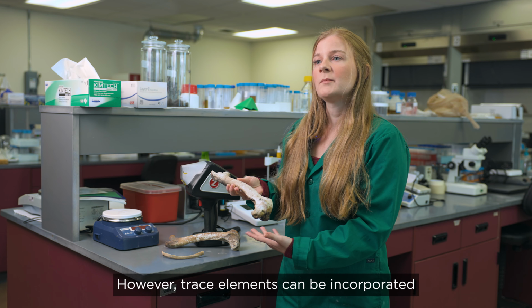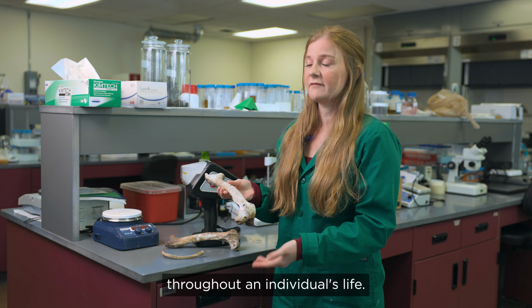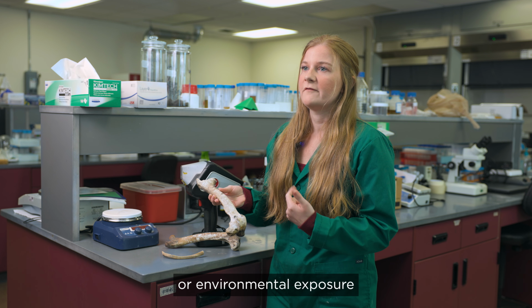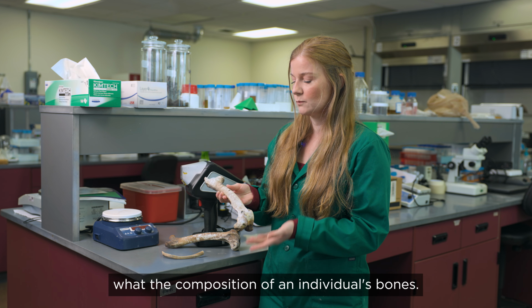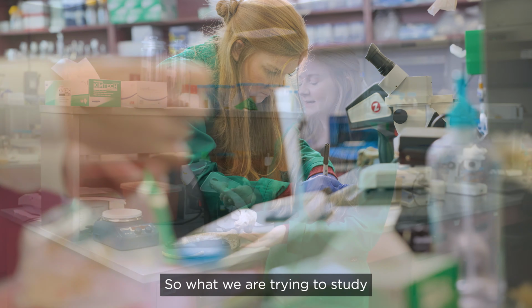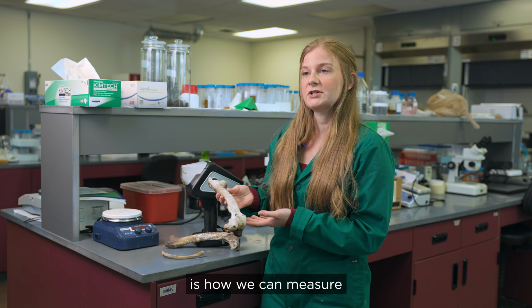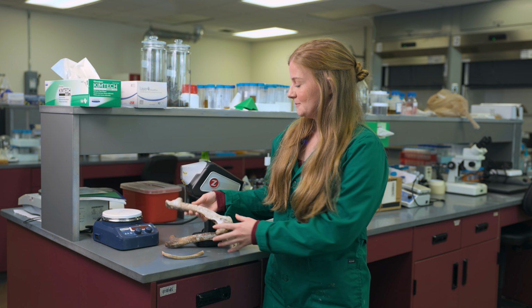However, trace elements can be incorporated into the bone matrix throughout an individual's life. Things like diet or environmental exposure or even health deficiencies or disorders can impact the composition of an individual's bones. So what we are trying to study is how we can measure those elemental differences in bone.